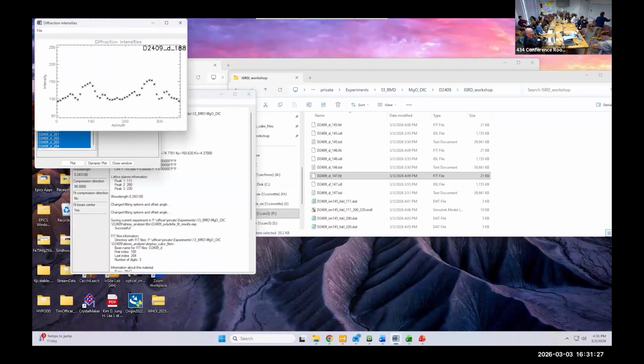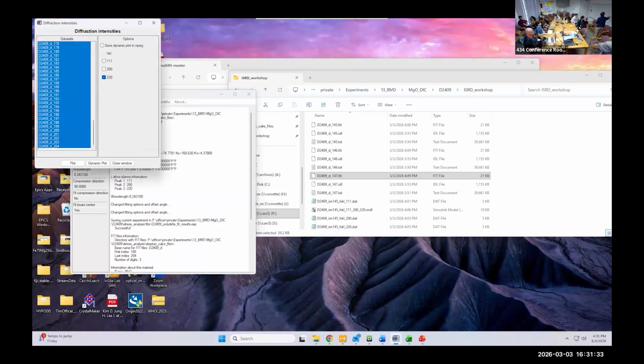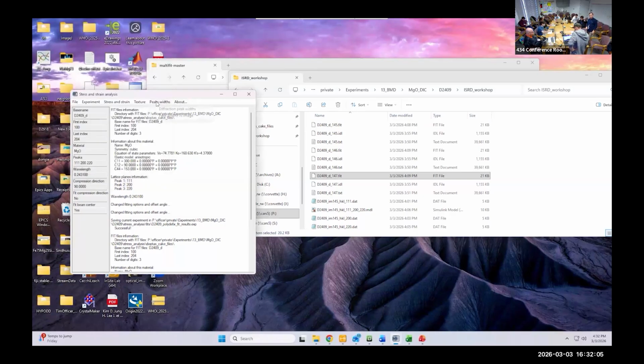The lattice remains the same, but the shape changes, right? Because you move matter from this end to the other end. And as you do this, because of the neighboring grains, the lattice has to rotate. So therefore, some particular plane will become preferred along certain diffraction vectors. So you see the higher intensity only along certain azimuth angles, depending on the lattice plane that slips around here. This is the important information. You can use this information to determine active slip systems.